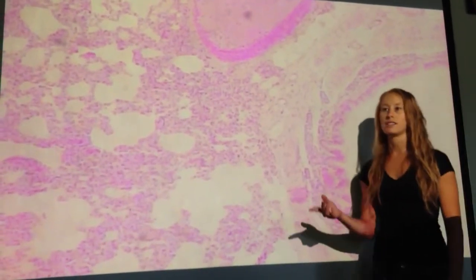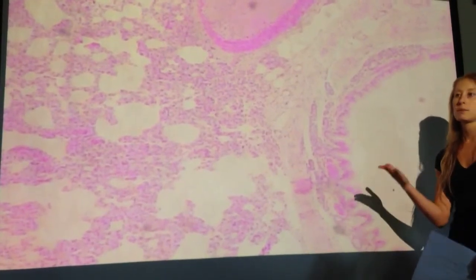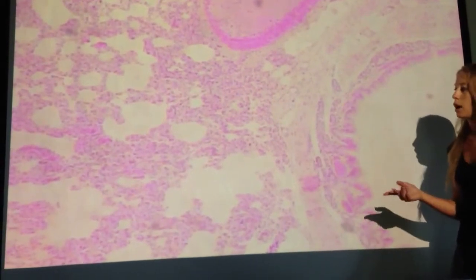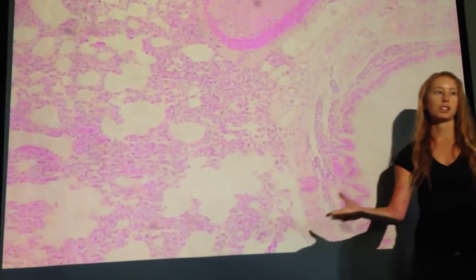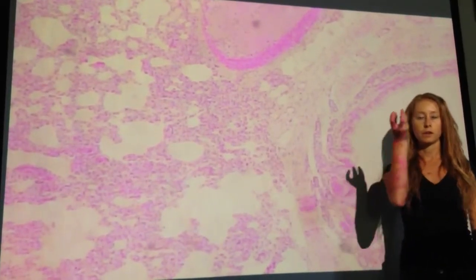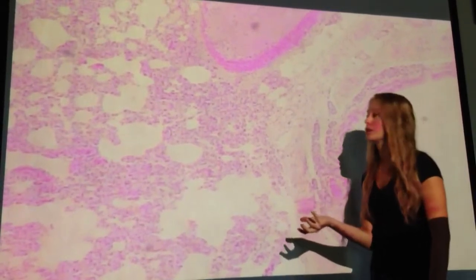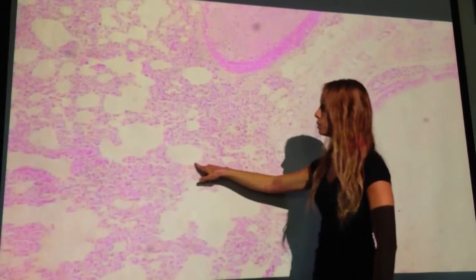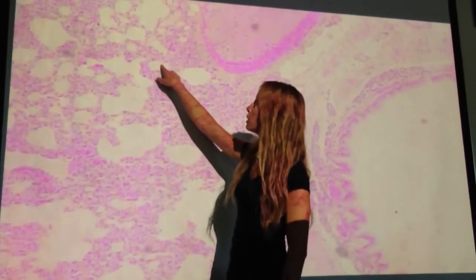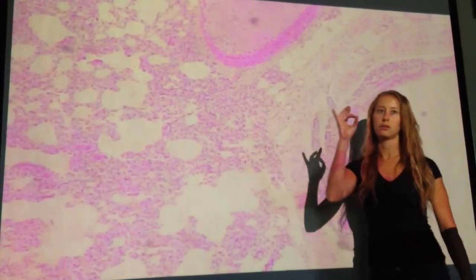Singular of alveoli is an alveolus, okay? So multiple would be alveoli. For the practicum, I would accept alveolus or alveoli, all right, just because it's kind of written incorrectly on the manual. But I'm going to start from the simplest level of organization and actually work my way up in my explanation. So an alveolus is a single circular pouch of gas exchange, okay? So when we identify that on the slides, we're looking essentially just for a complete circle. So this would be an alveolus, another one there, a smaller one here, another one here. So you're just looking for a complete circle, okay?